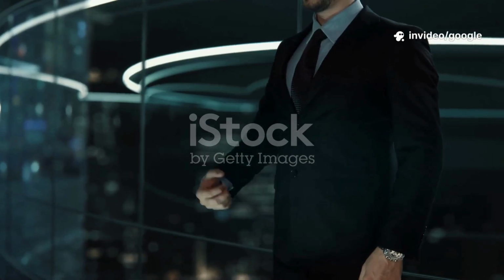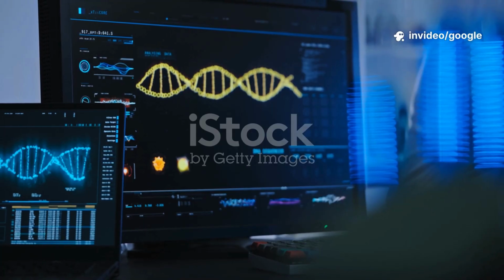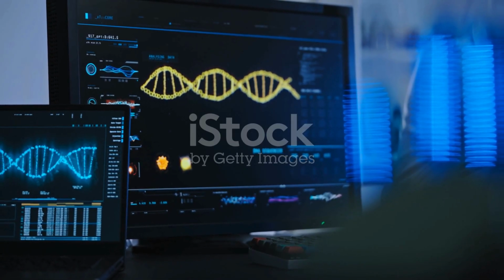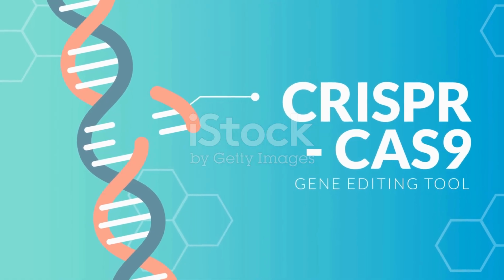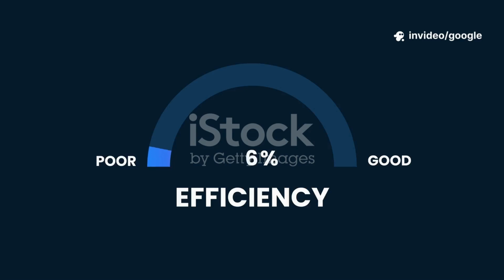Utilize design tools. Many online bioinformatics tools are available to help design gRNAs with high predicted activity and minimal off-target effects. Consider modifications. Chemical modifications to the gRNA can enhance stability, reduce immune responses in cells, and improve overall editing efficiency.